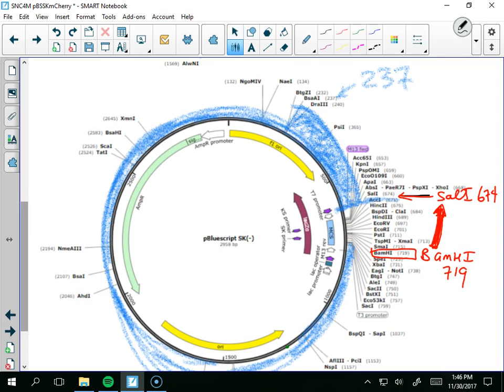Okay. How'd you get that? 674 to, and that gives us? Okay, so from here to here is 437.